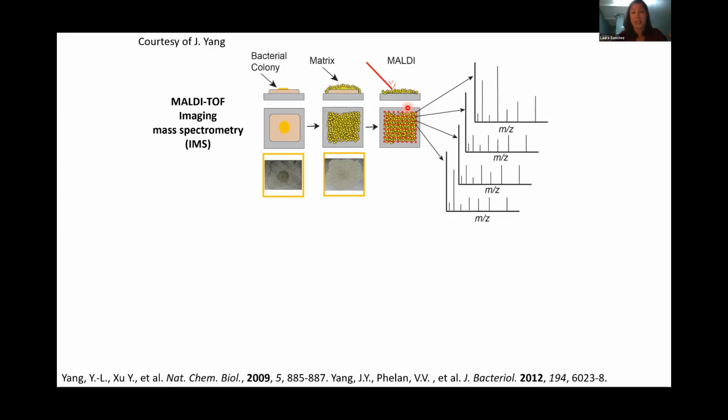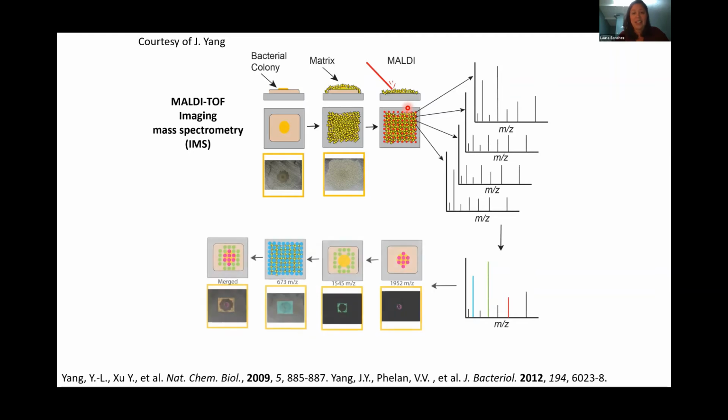If you're doing untargeted metabolomics, this is great. We look mainly at the small molecule region, somewhere between 100 Daltons all the way up to 2000. This generates a lot of data, with an overall computational average of all the resulting data, which can be up to thousands of data points. That's where the magic comes in. I think Vanessa maybe coined the term: this is our hypothesis generating tool. In these untargeted microbial systems, this allows us to figure out whether a signal was colony associated, excreted, or just everywhere and part of the background, as either the matrix or the media itself.